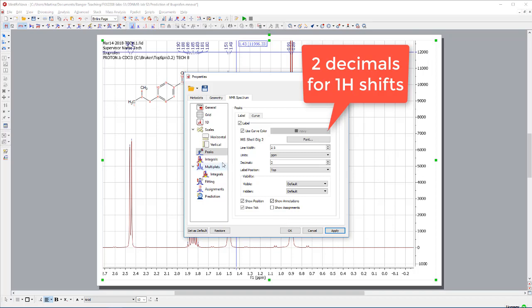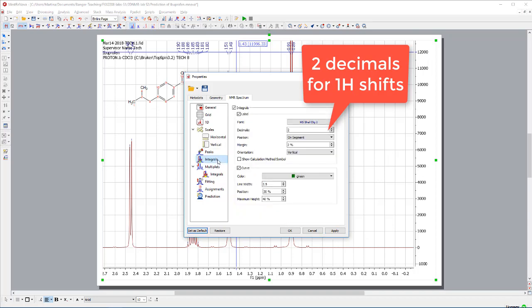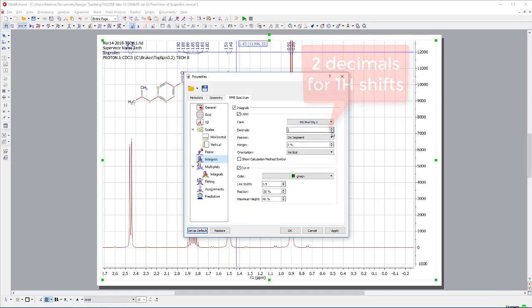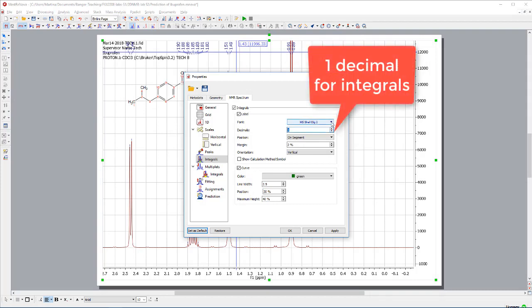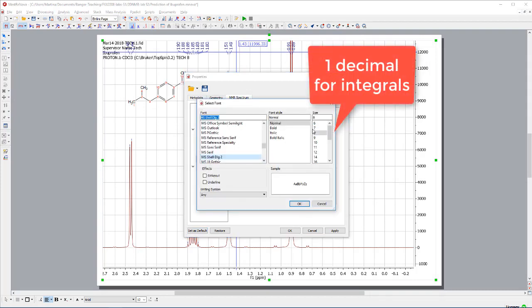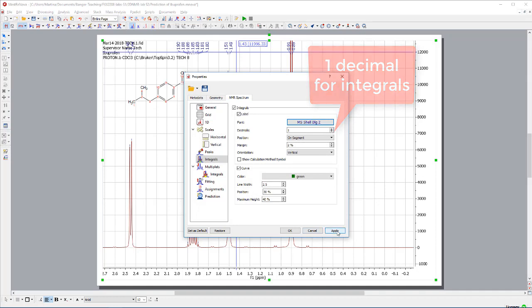Since I'm already here for the integration, I can just change to one decimal because that's what I want to use. And the font I will again set for 10 because it's easier to read. Apply again.